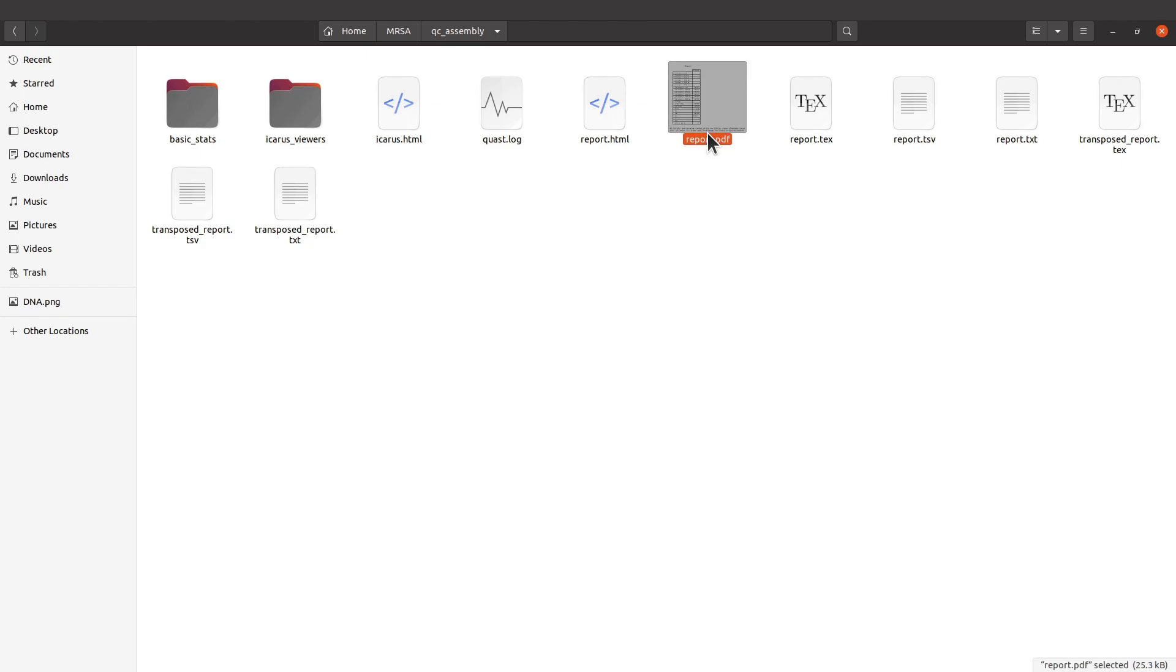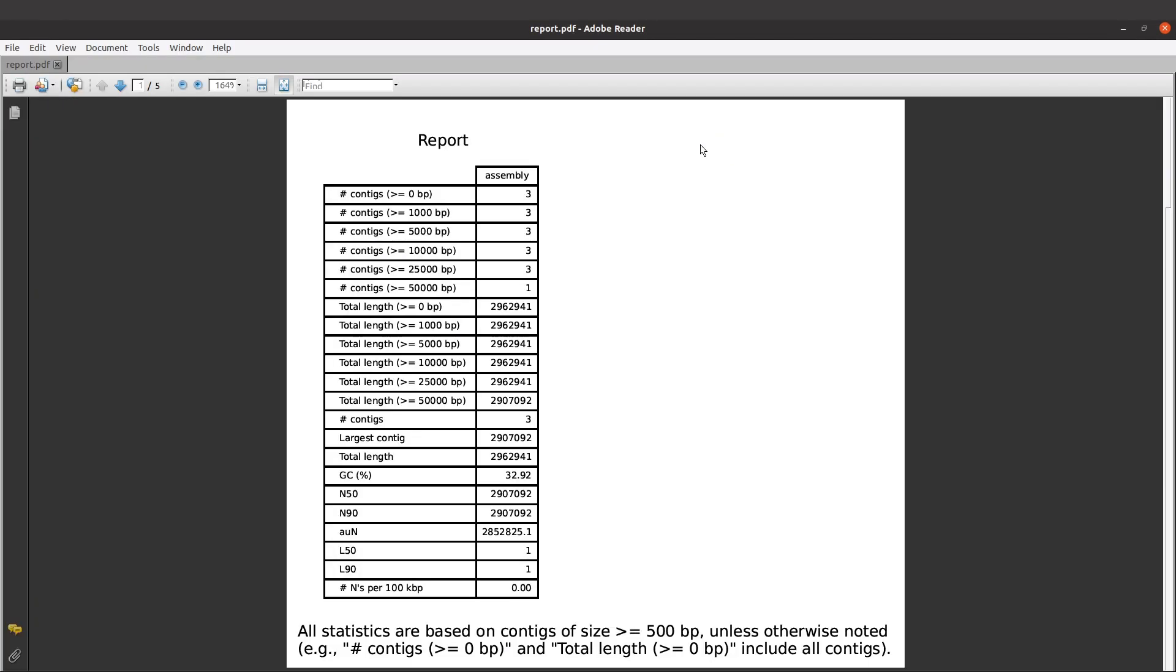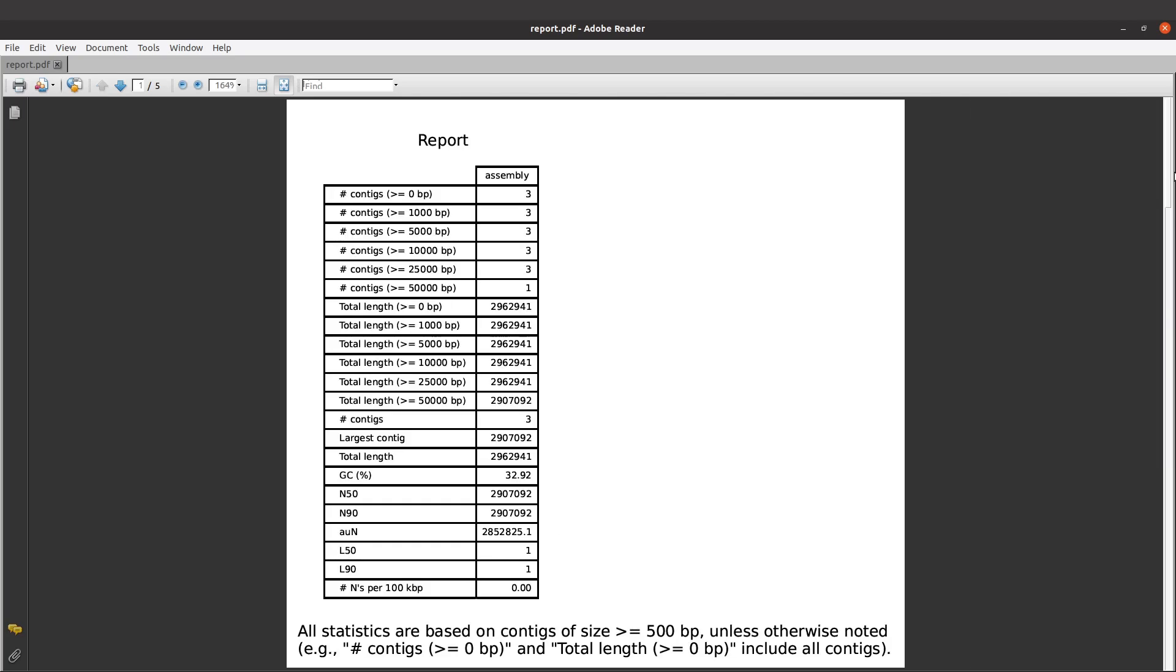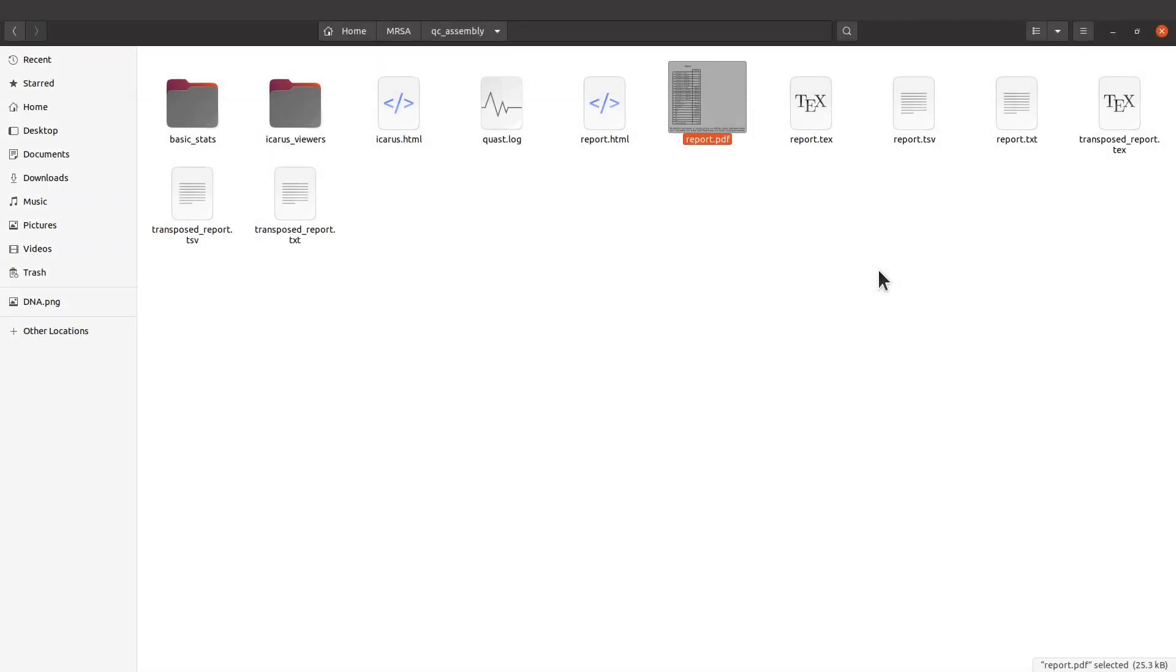I'll open it now. We have the analysis results here, so you can scroll through and check whatever you want, but I'll use the HTML. I will open that using my browser.